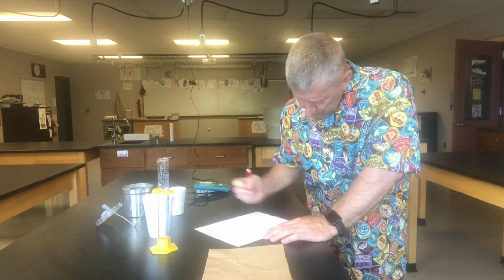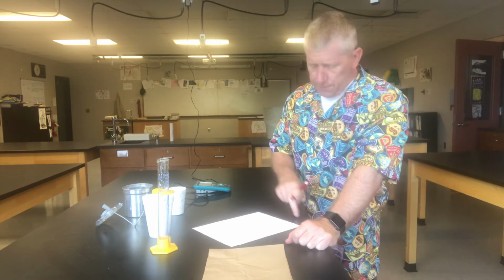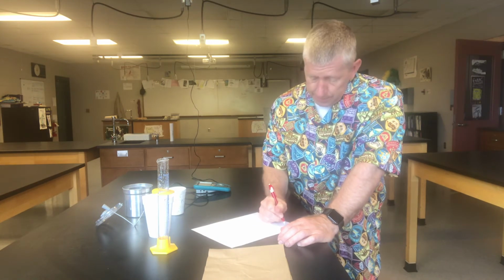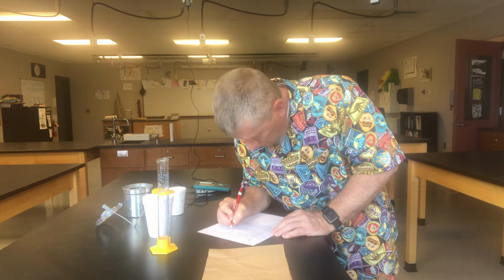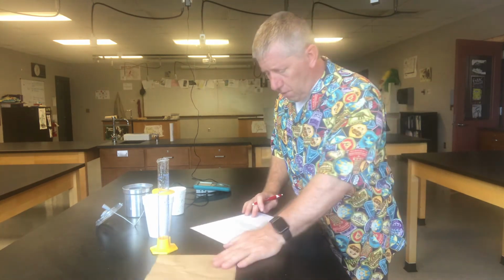Whoa, good thing you're with me, lab partner. I appreciate you checking up on me and making sure everything is on the up and up here. So this should be 23.4, 24.4, 24.1. 24.1 is what it should be. I'm doing that in my head. But let's just check it. Okay, add those up. Yep, 24.1 milliliters is the mass of our water. 24.1 milliliters of the mass of the water after it melts.